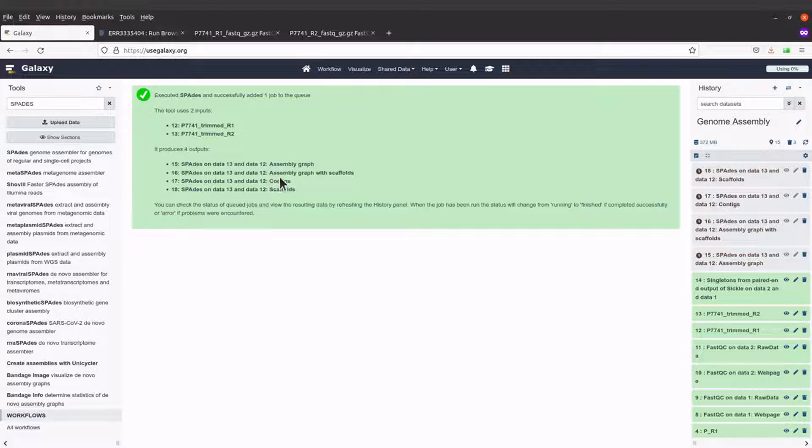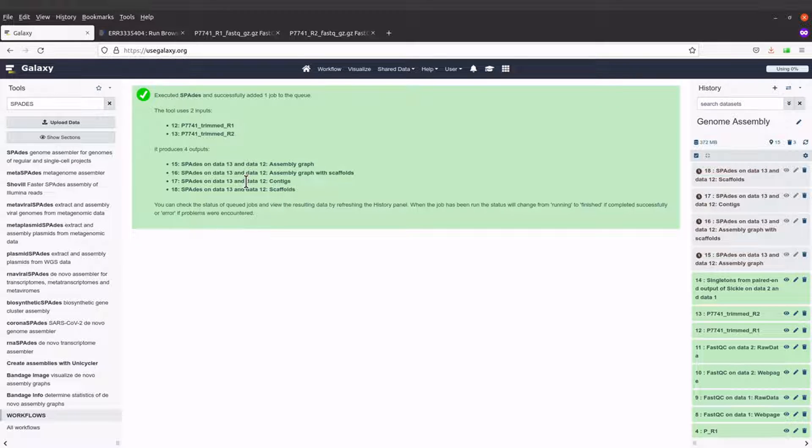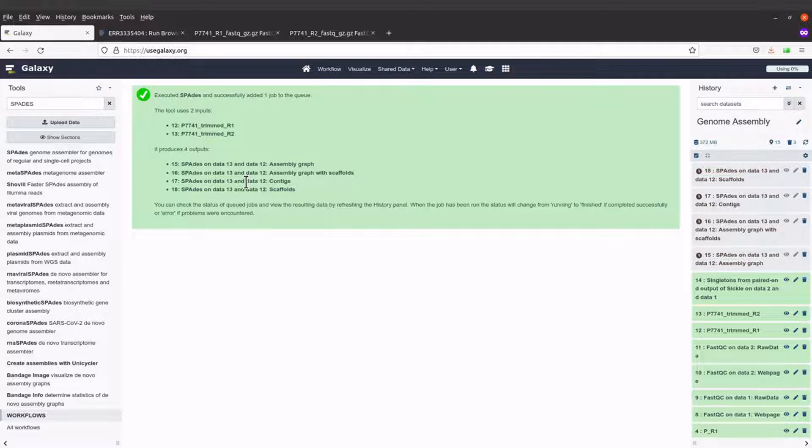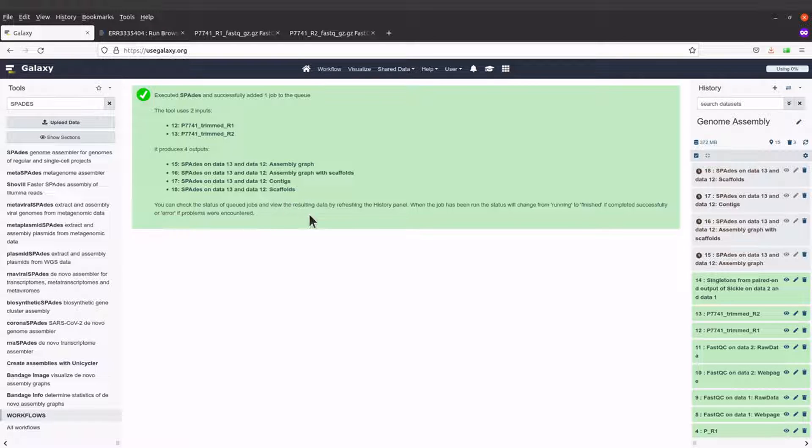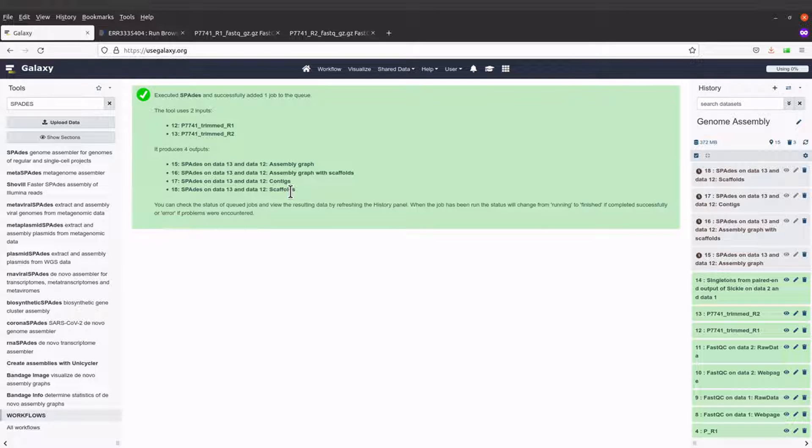We also have Quast stats and scaffolds. With the SPADES outputs, if you check the documentation—I checked myself—it's recommended to use the scaffold for downstream analysis, so that's what I recommend you also use.